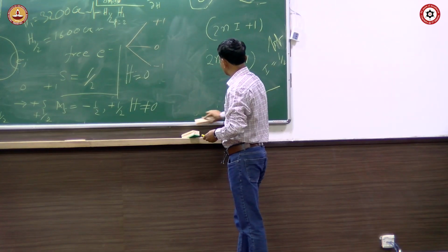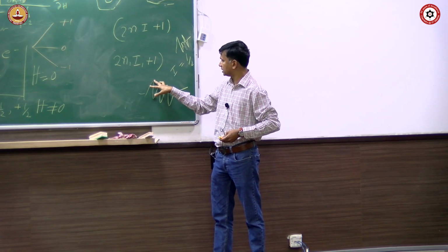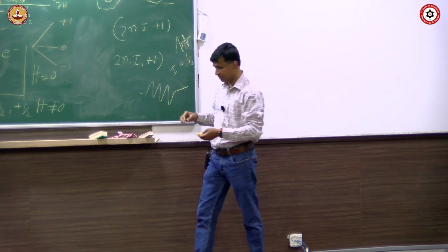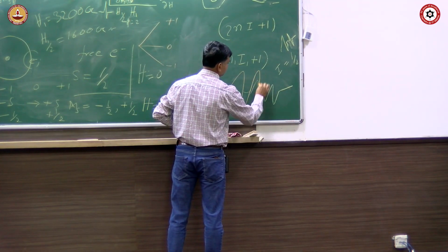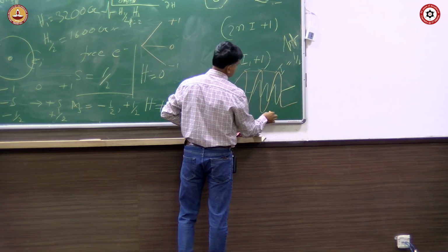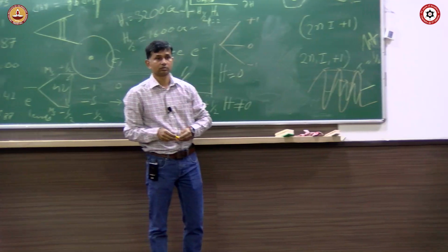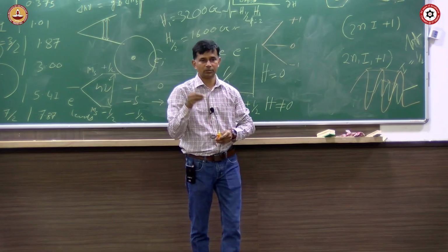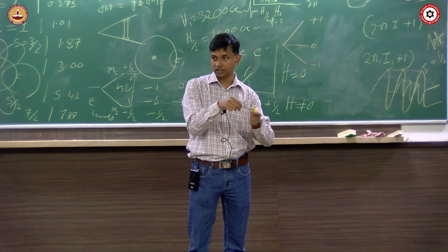Now these lines you see here are the coupling constant. By this separation, you can also speak about how strongly they are coupled. If I get the same lines, 2 lines, 3 lines, but this time they are coming like this, you see the separation is higher. Here the separation is smaller. So what does it mean? That means the electron in the second case, the orange case, is more strongly coupled than in the first case.